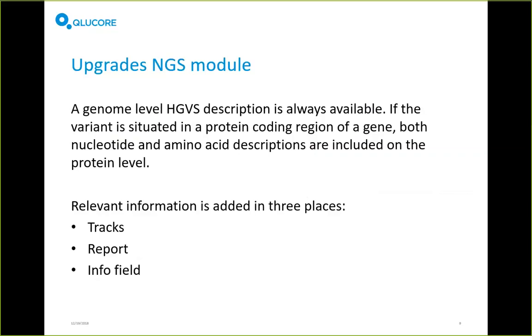So there's information added in the tracks, in the report, and in the info field. I won't be showing this today because not everyone here is into NGS, and there will be NGS webinars during the early spring to show these added features of the NGS module. So I won't show this today at all. I'm just mentioning it.